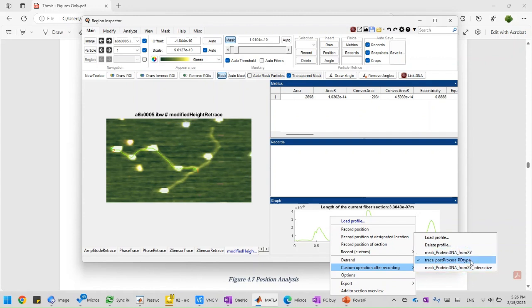In the end, you would have to process the data again, for example in Excel, to do more complex calculations like the crossover, but you can also customize the script to do it for you. That's up to your choice. Right now we're going to use the simplistic one. It may not be accurate, but it's useful to let me know, as I measure, whether I have a specific complex or not.